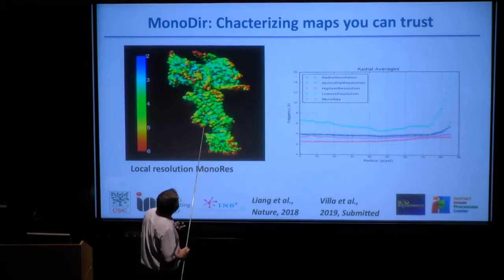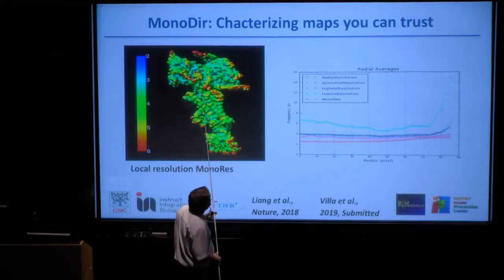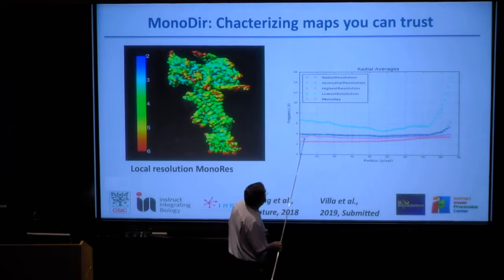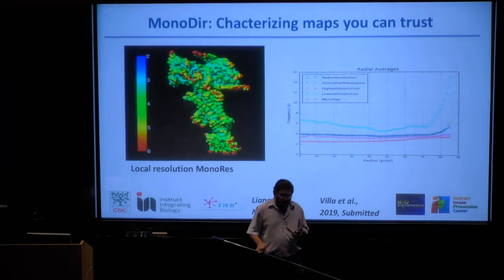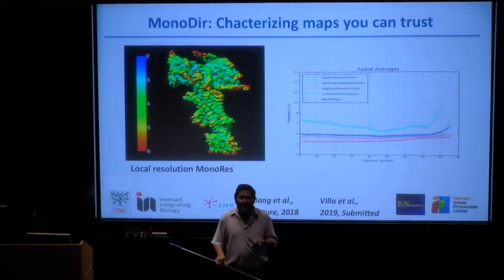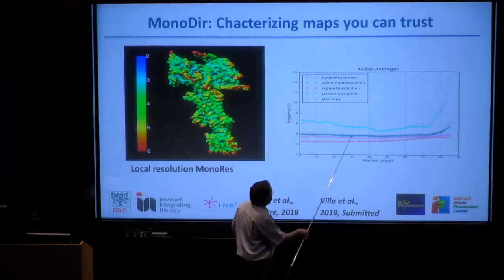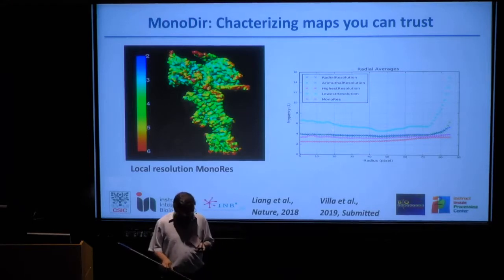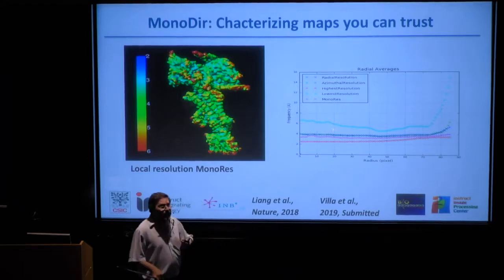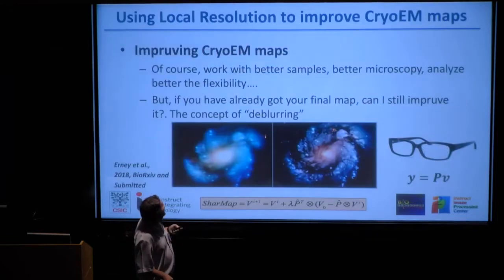And this is one application, this is one GPCR reconstruction from Saxton group in Monash, and you see that really we were working with him to see how well determined the angular assignment had been in his case, and really it was a very good example of very good determination of the angular assignment. So we were happy in that we had something new to contribute to the field of validation.